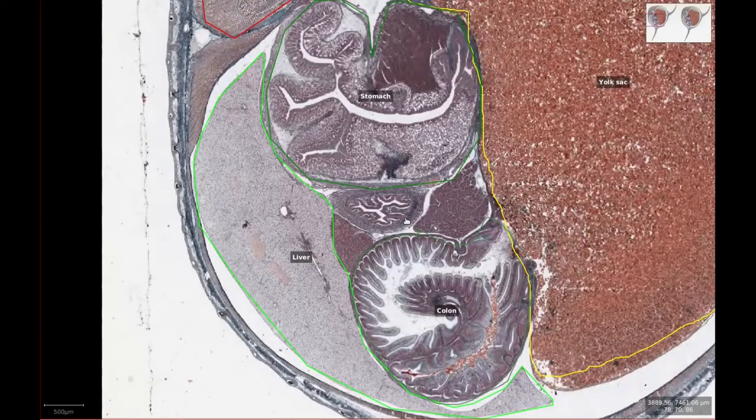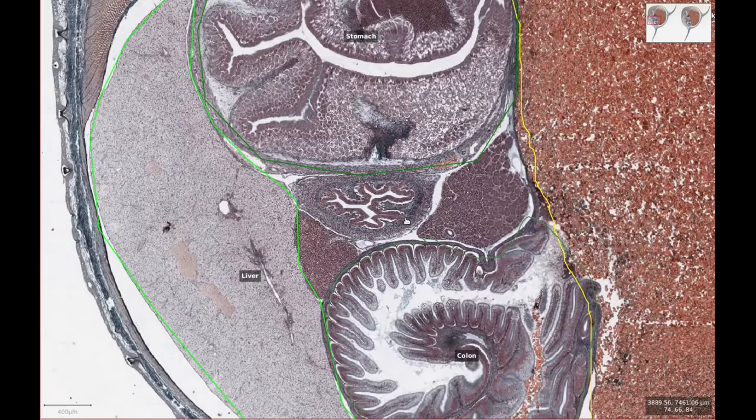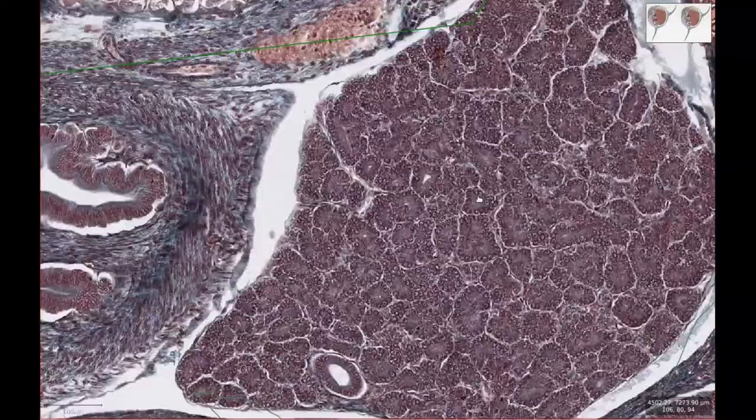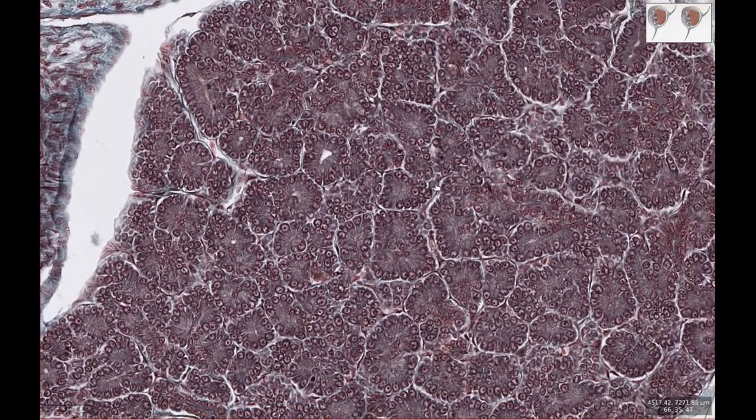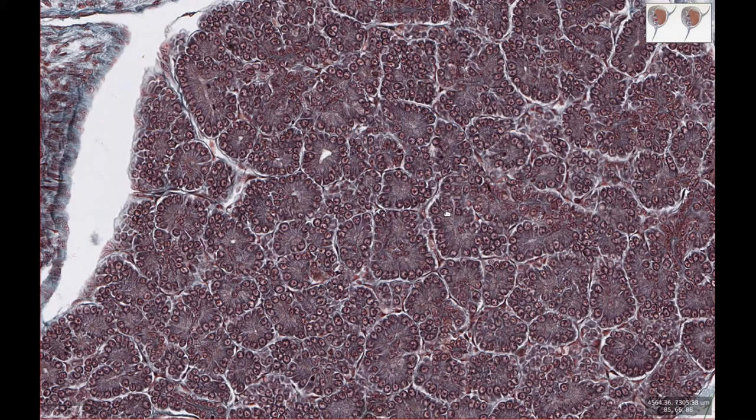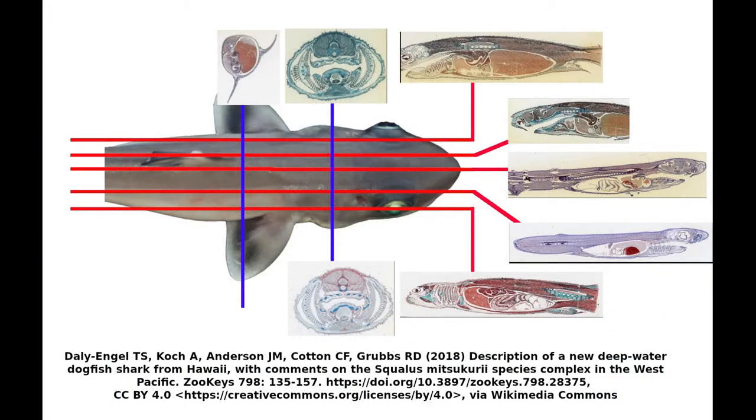Between the stomach and colon there is a round section of intestine, and next to that there is a section of glandular tissue which is likely to represent pancreas. This picture summarizes where each section is likely to have come from, given the organs we can see on each slide.